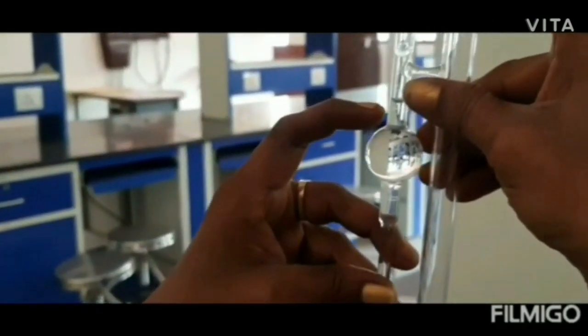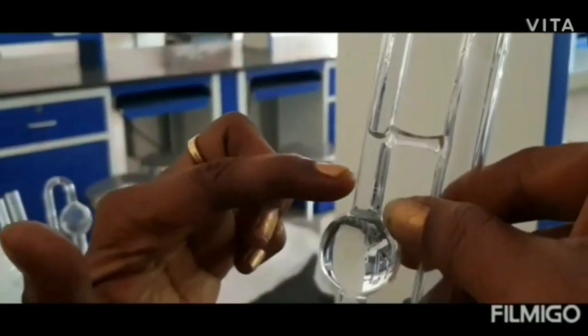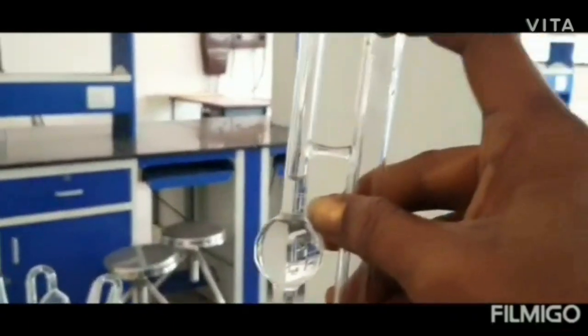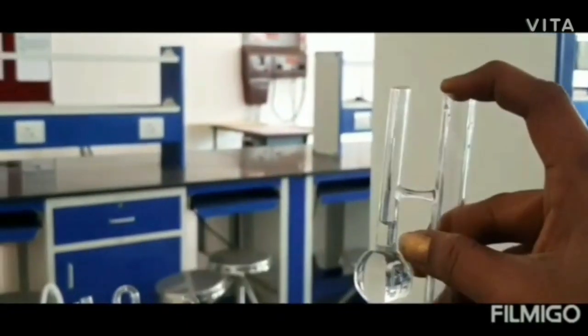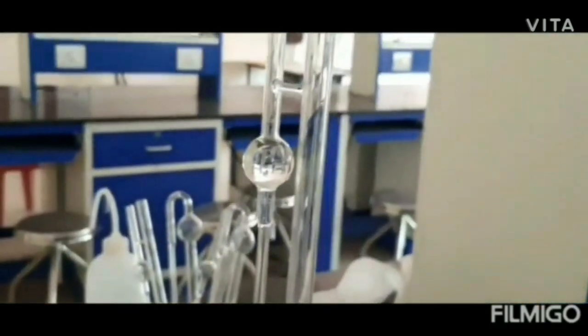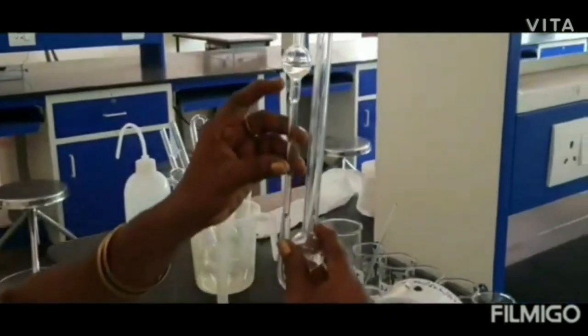We have to pipette out until the liquid reaches a level just above the upper marking. So there will be an upper marking and a lower marking. It should reach just above the upper marking. Until then we have to pipette out. Then adjust it to come to the upper marking. When the solution reaches the upper marking, we have to start the stopwatch, and then wait until it reaches the lower marking.